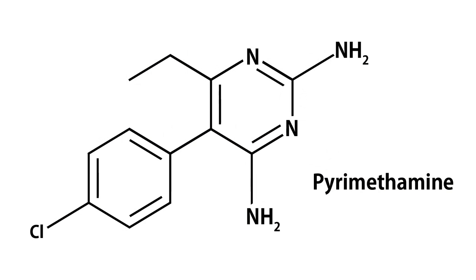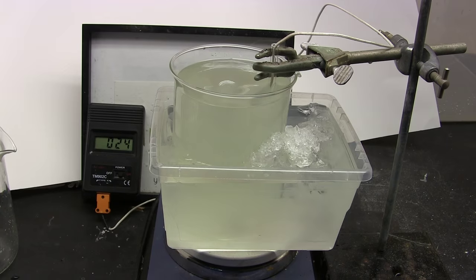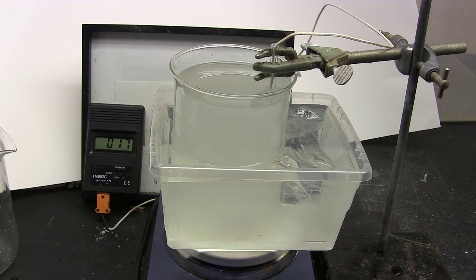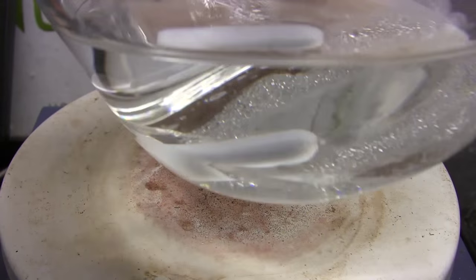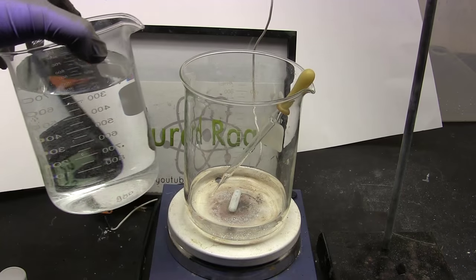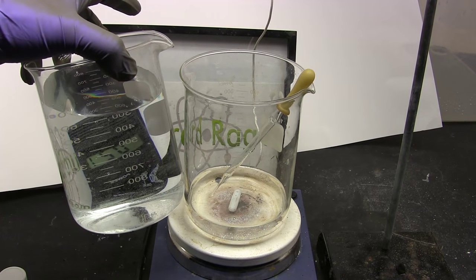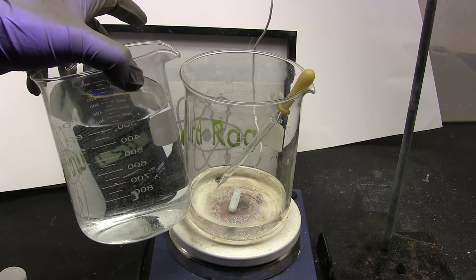I want to use it to make an antiprotozoal drug. Now we already started making propionic acid in a previous video where we used the haloform reaction to produce chloroform from methyl ethyl ketone. A byproduct of this reaction is the formation of propionic acid which we will recover and purify in this video.